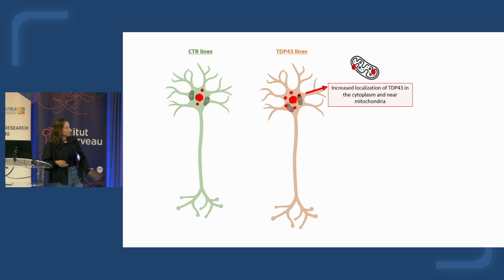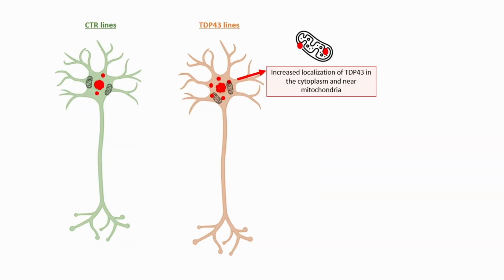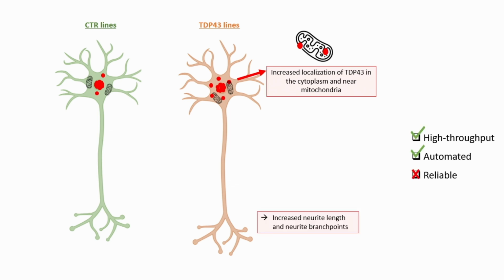So here I just showed you a slightly increased localization of TDP43 in the cytoplasm and near the mitochondria in the TARDBP patients. This was, again, not reliable, so I'm not going to show you more here. We tried to get other parameters.